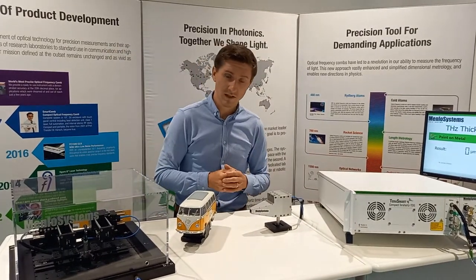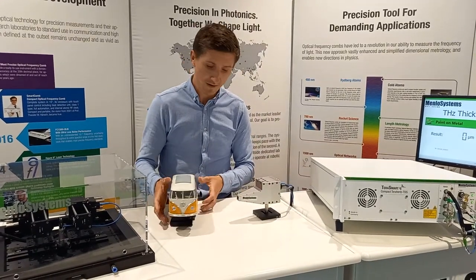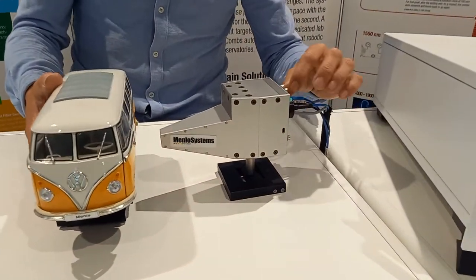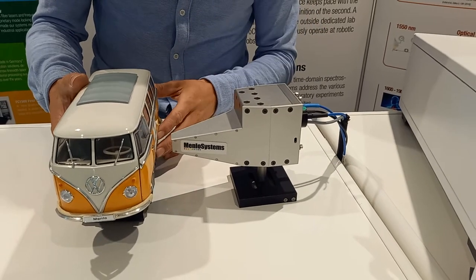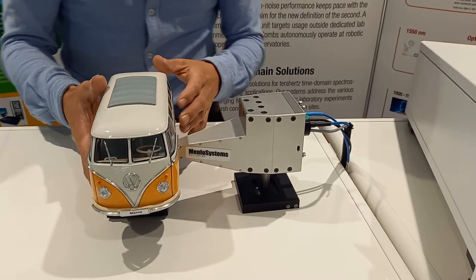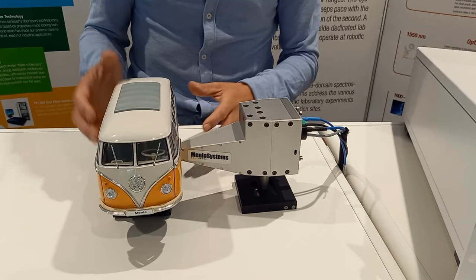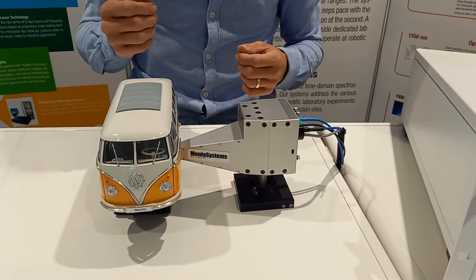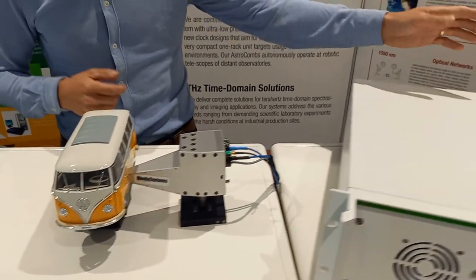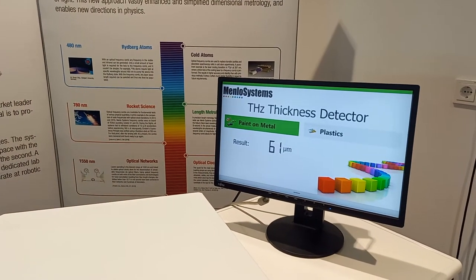Let's start with the thickness detection algorithm. I'm going to use as a sample this nice VW wagon. I put it very close to the reflective sensor head — we have one emitter and one detector with Terahertz optics inside. I place it very close to the paint on the metal layer of the car. It's a contact-free solution and is of course harmless, enabling non-destructive testing. If you look at the monitor now, you will see a thickness of this paint on the metal layer of this VW wagon of 60 microns.